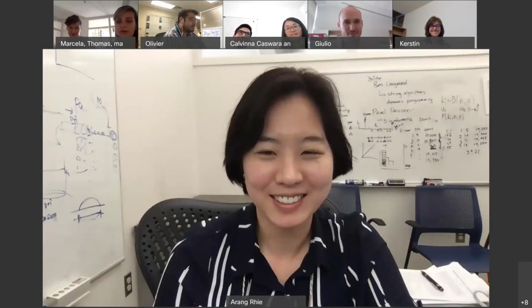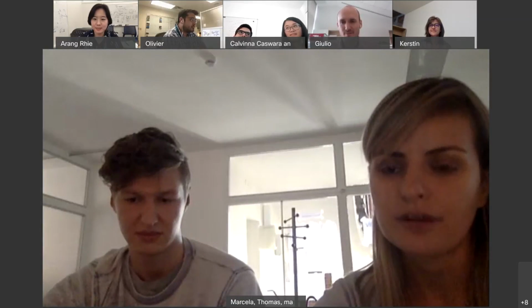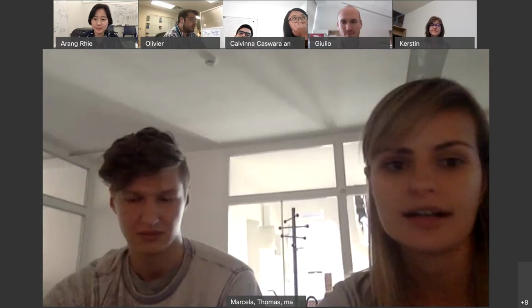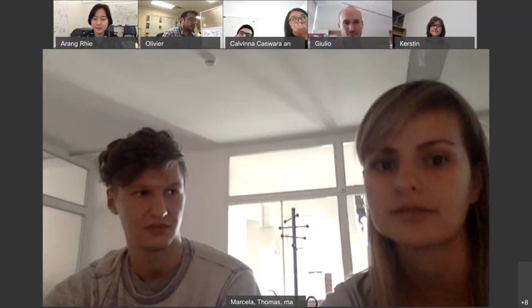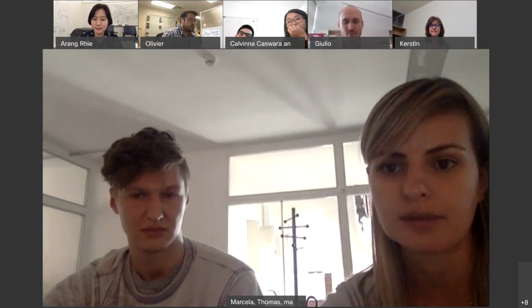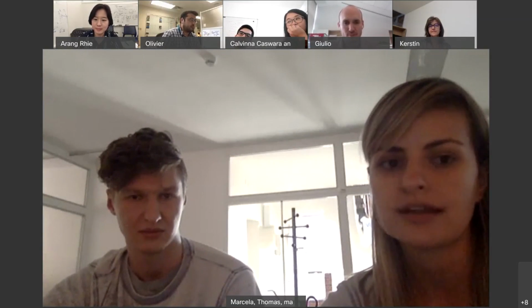One more comment: I'm assembling another species, a toad. I assembled with Falcon, and then put it through Purge Dups. I am running the k-mer analysis now comparing the reads with the assembly, and I guess it looks good. We have to discuss that, because I think the 1.6 pipeline would put Purge Dups just after Falcon.